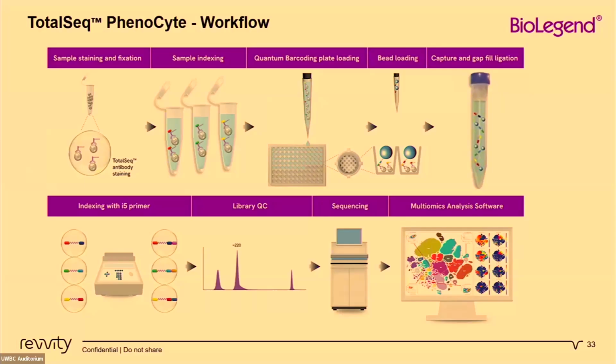You have your sample staining. Similar to our other processes with our universal cocktails, you're going to label your cells all together with your TotalSeq cocktail. You can use hashing to multiplex samples in this case. But in this method, depending on the size of the kit you bought, we would want you to do hashing on your samples separately, then pool them together, and then stain with the antibody cocktail.